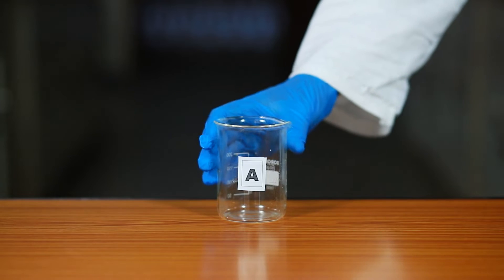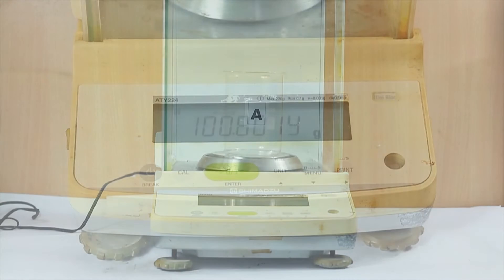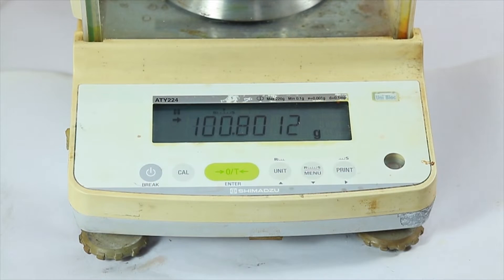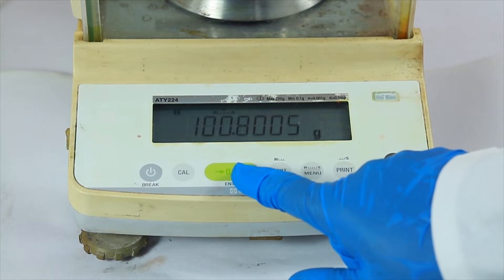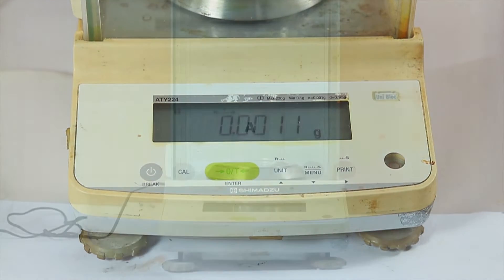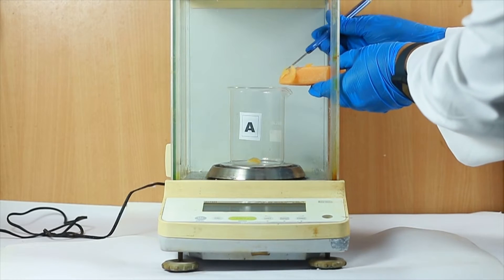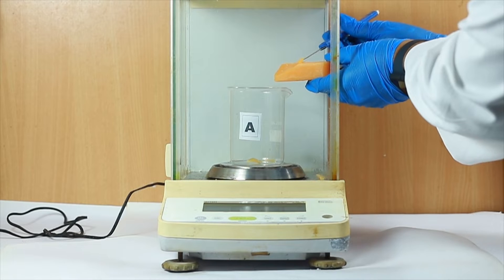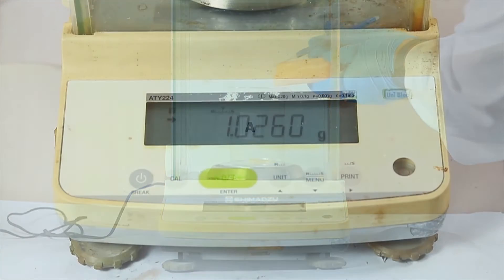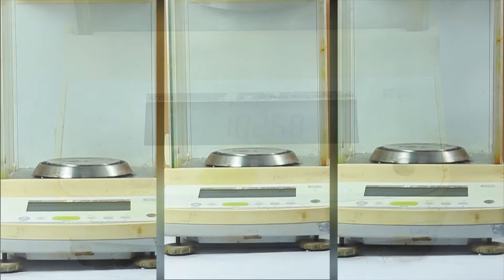Put beaker A on the electronic weighing balance. The weighing balance shows the weight of the empty beaker. Use the tare button to show a reading of 0.00 grams. Add soap A into the beaker by making it a small piece using a cutter knife until the electronic balance shows a one gram reading. Repeat the steps for B, C, and D.